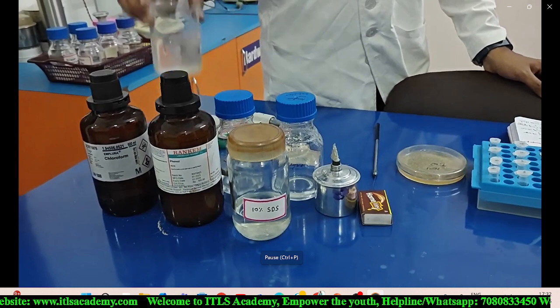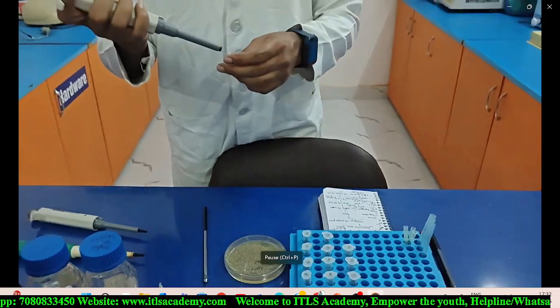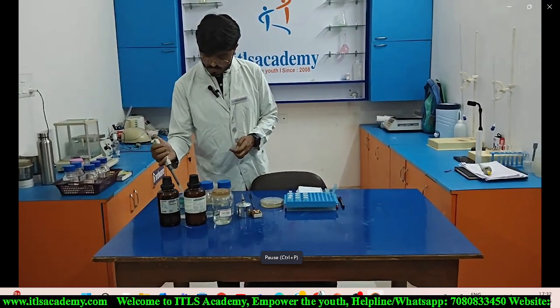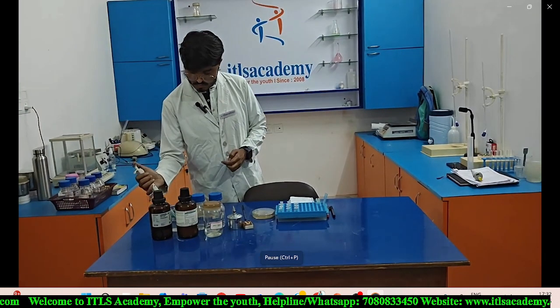Okay. So first of all, the very first step is take 1 ml of distilled water in the Eppendorf, and you can see we have already marked this in the pipette. Now I'm going to pour the measured water in this.